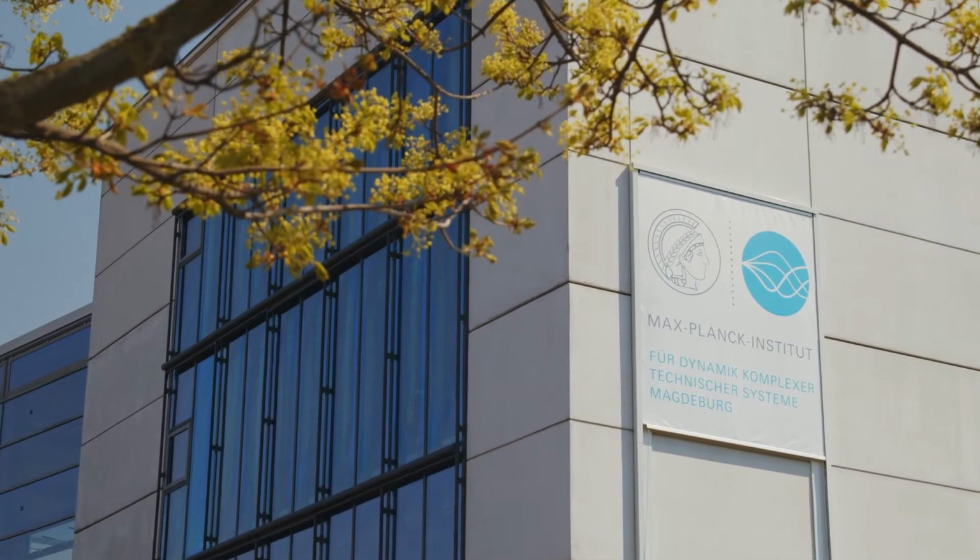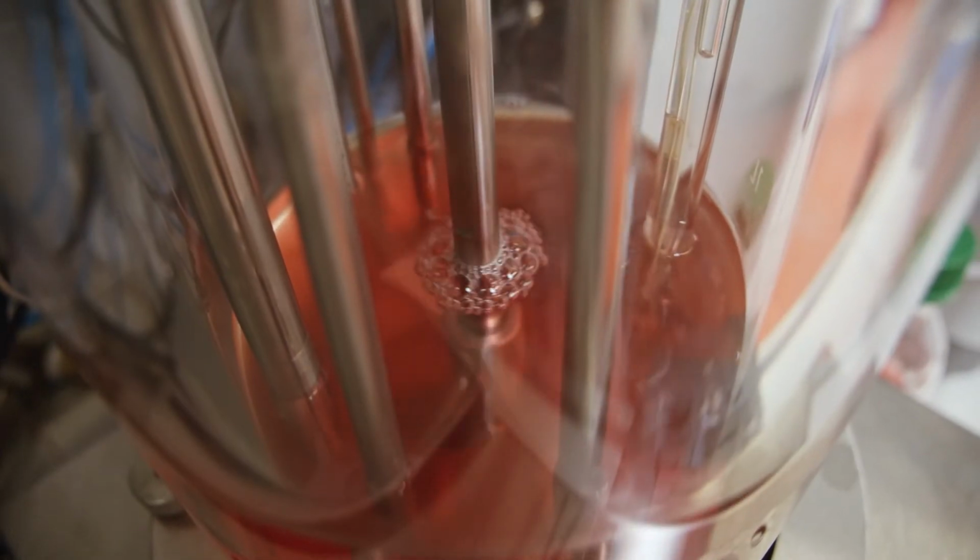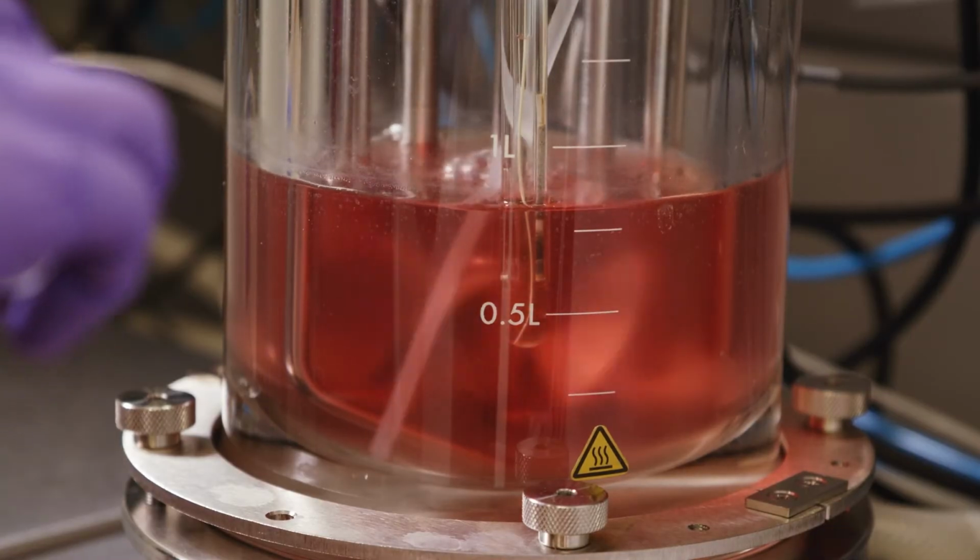And what we did was that we introduced an innovation here in the Max-Planck-Institut in Magdeburg, where we built a tubular reactor. This is something completely new. So this innovation, by introducing the tubular reactor, allows us to produce viruses in continuous mode and stably. This technology, the amount of vaccines that it can produce, it's a real solution that can be put out there.